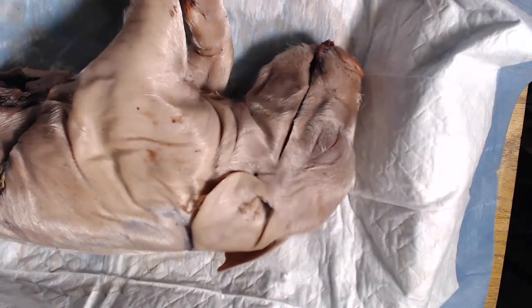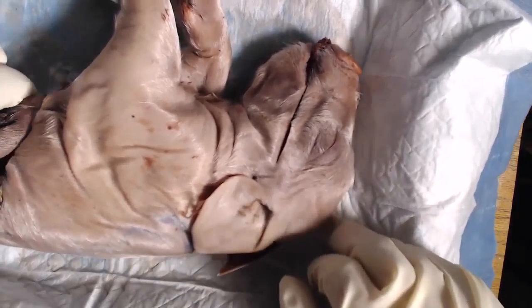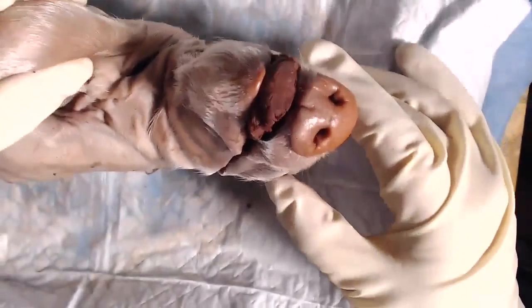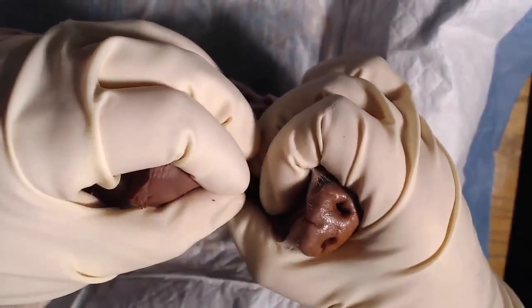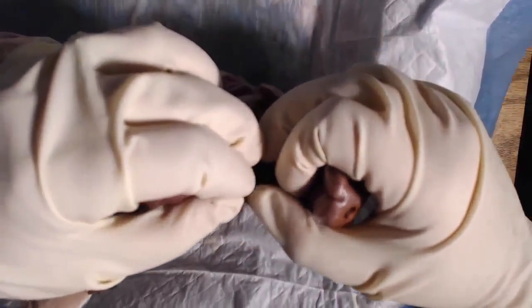All right, if everyone's caught up, we'll go ahead and move on with the next step. So go ahead and lay your pig on its back. Now we're going to separate its mouth. We're going to pull down on the jaw as hard as we can to separate the structures we just cut through. So go ahead and grab the jaw and the snout here and just pull them apart.